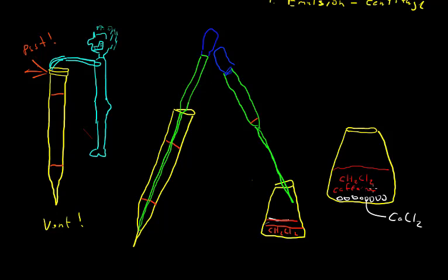So you'll add the pellets, you'll kind of swirl this around. If the pellets get hydrated, they stick together, and so you'll see them start clumping together. So you want to continue adding these calcium chloride pellets until they no longer clump, until when you swirl this around, you see some of these pellets moving around independently. Once you've gotten to that point, then you're going to decant the dichloromethane off into another flask, leaving these pellets behind.